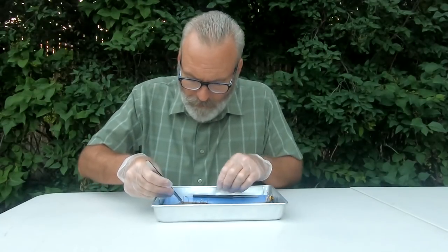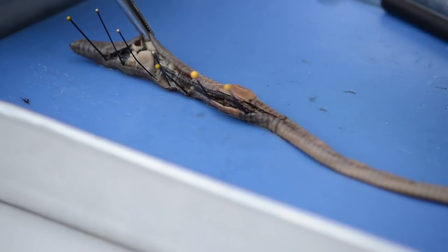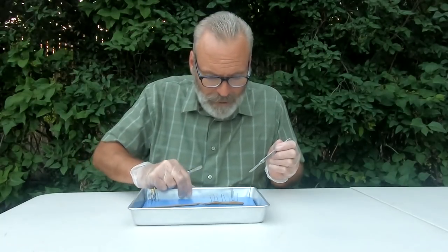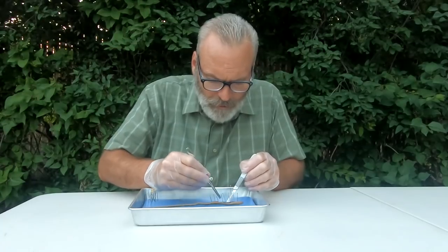I'm going to tug on this body wall just a little here, and in doing so that's going to allow me to get inside. I'm going to spin this — a lot of times I'll spin it this way so I can get on this side and see it a little better.